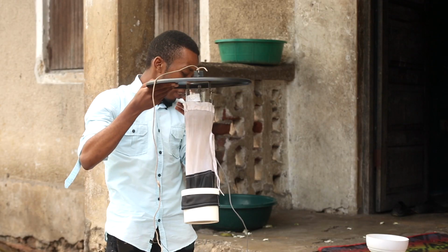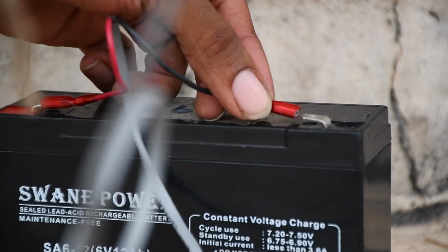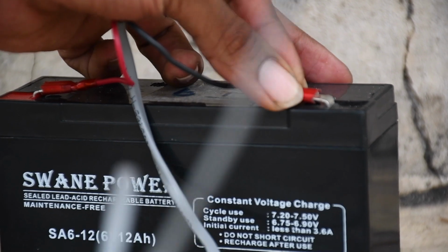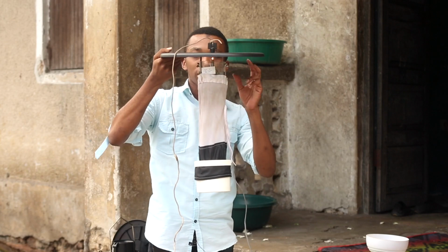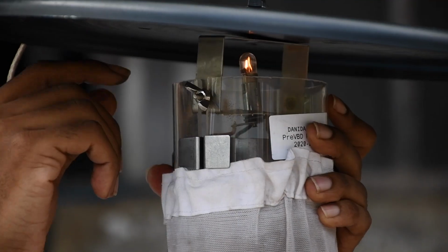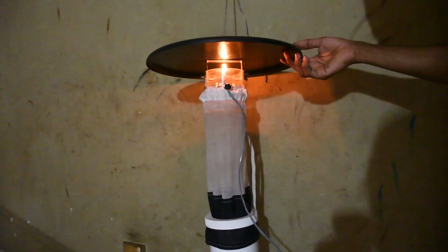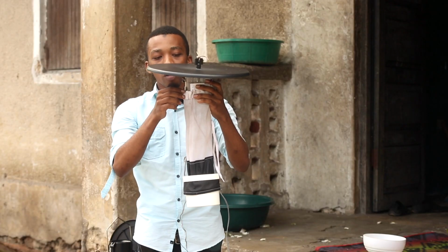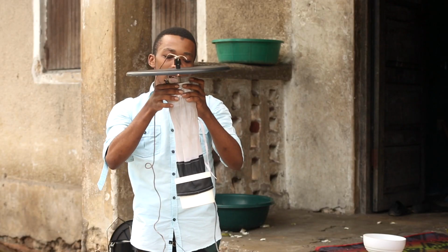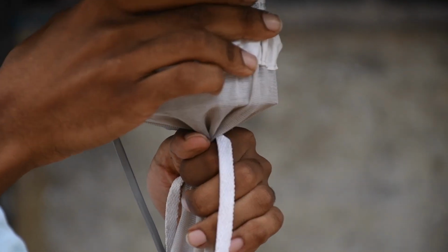So basically we connect the light trap to its battery, the red wire to the positive side of the battery, and the black one to the negative side. You can hear some sound coming from the light trap, which originates from the fan that acts as a vacuum that sucks in the mosquitoes. During the duration, which is about 12 hours from evening to morning, the mosquitoes are trapped in this little cup, which will later be tied to prevent the mosquitoes from escaping.